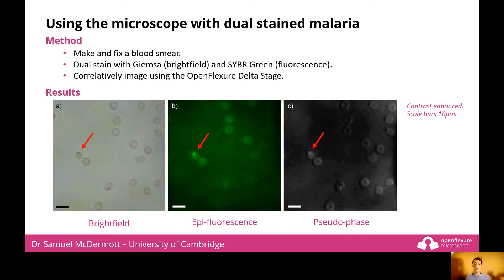As an example of using the OpenFlexure delta stage for correlated imaging, we look at malaria blood smears. We dual stain our smears with Giemsa for bright field imaging and SYBR Green, a fluorescent stain. They both target the parasite's DNA and so indicate where the parasites are. If we image using different modalities and correlate the images, we gain extra information about our smears and the location of the parasites. Captured using the OpenFlexure delta stage, here are examples of a bright field image in which the Giemsa-highlighted purple parasite can be seen inside the red blood cell.